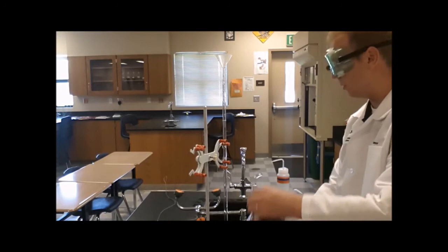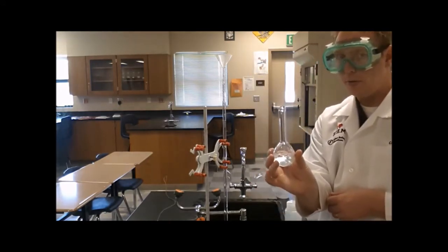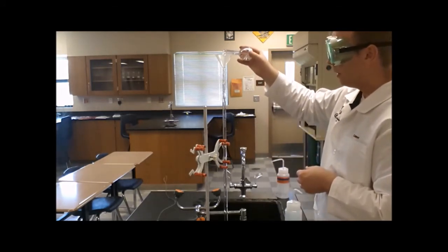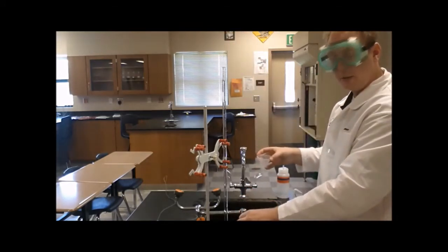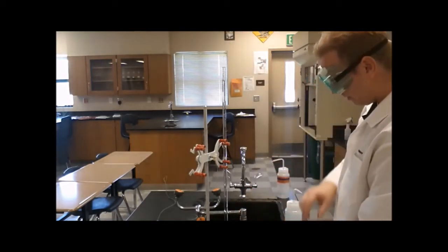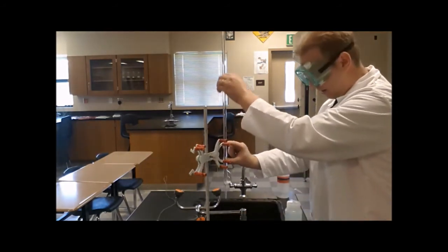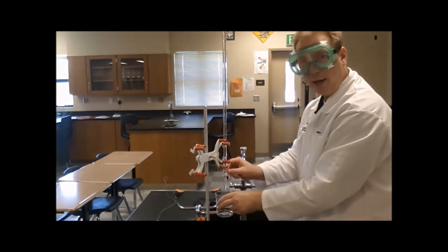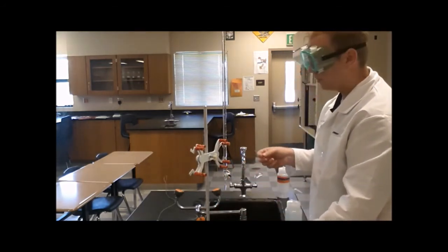Didn't have enough sodium hydroxide. Let's add more. Adding it directly from the volumetric flask can be tricky because the volumetric flask tends to glug. And you want to be careful that you don't glug out more than you actually need. Uh-oh, I glugged out more than I actually needed. So what I can do is take the burette and let sodium hydroxide back out into the beaker until it gets back down to something I can actually measure.